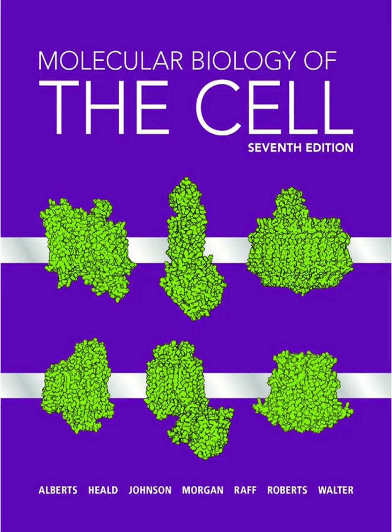How much better is the resolution, typically? The wavelength of electrons used in microscopes is incredibly short, like 0.004 nanometers. Theoretically, resolution could be near atomic. In practice, for biological samples, due to lens aberrations and sample issues, it's more like 1 nanometer or 10 angstroms. Still 1 nanometer. That's 200 times better than the 200 nanometer limit of conventional light microscopy. A huge leap in resolving power.